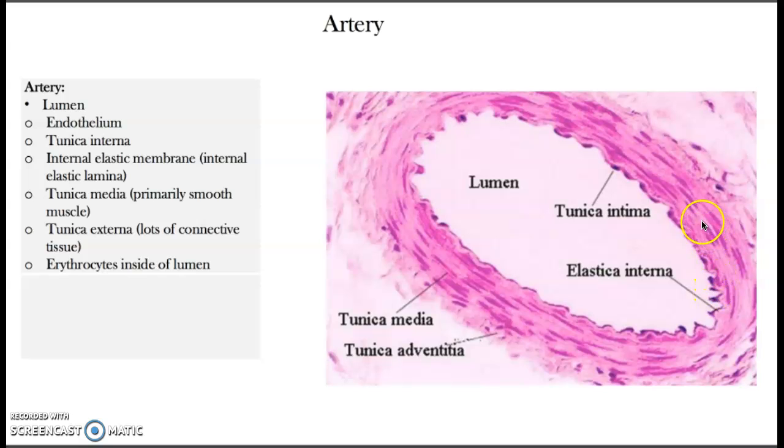The endothelium is a simple squamous epithelium. This is important for your knowledge. Why? Because it's a way to interchange gases in the case of the capillaries. And the endothelium, again, is simple squamous, lining the space, lining the lumen.